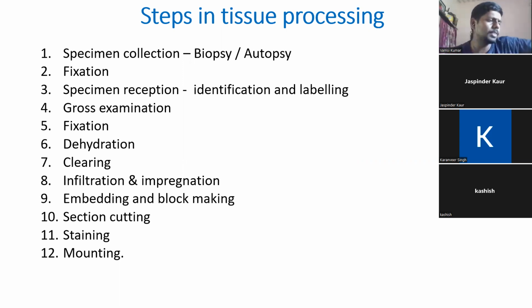For this purpose, we go for the clearing step, which is done with the help of xylene. One second, let me mute my phone. So that is clearing.